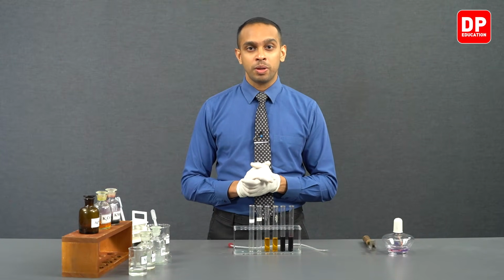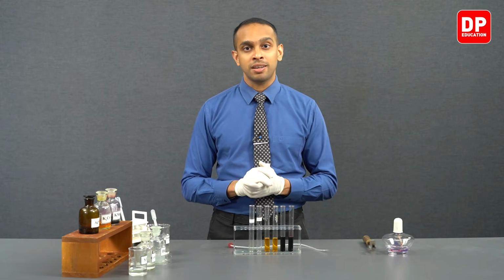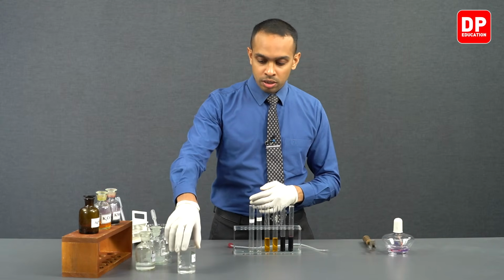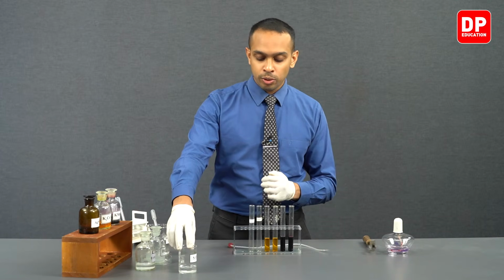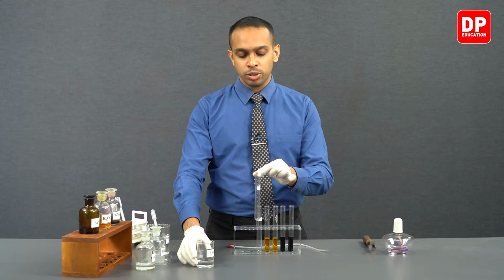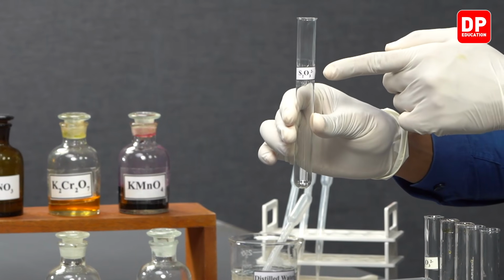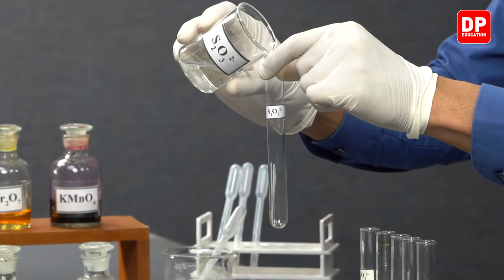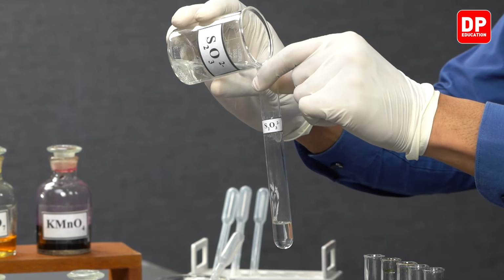Now students, we are going to be looking at the identification test for the thiosulfate ion solutions. We have our thiosulfate ion solution here, and we are going to take a small volume of the thiosulfate ion solution to a test tube labeled thiosulfate so that we can very clearly identify which test tubes are containing thiosulfate.